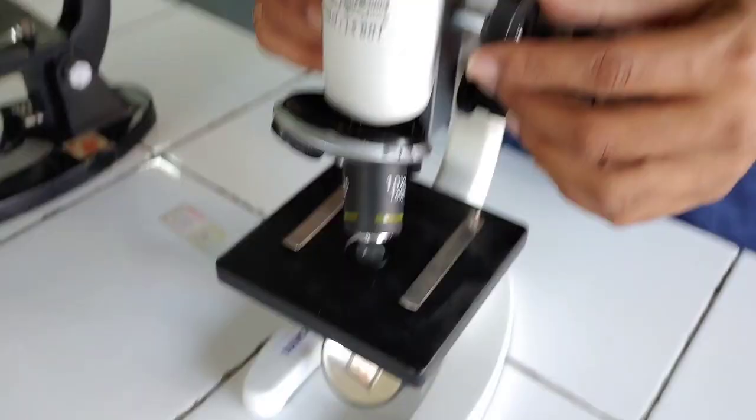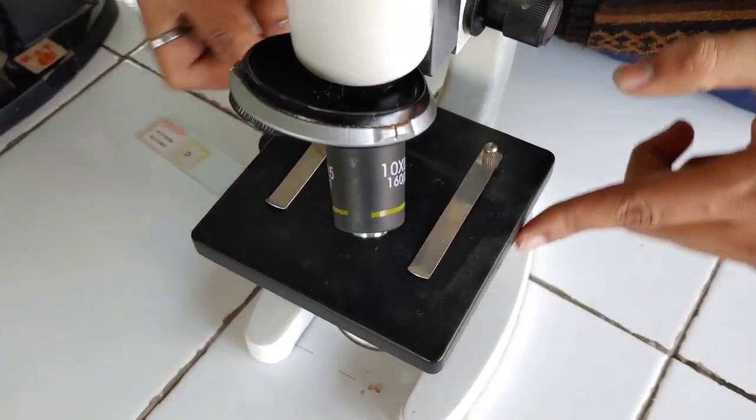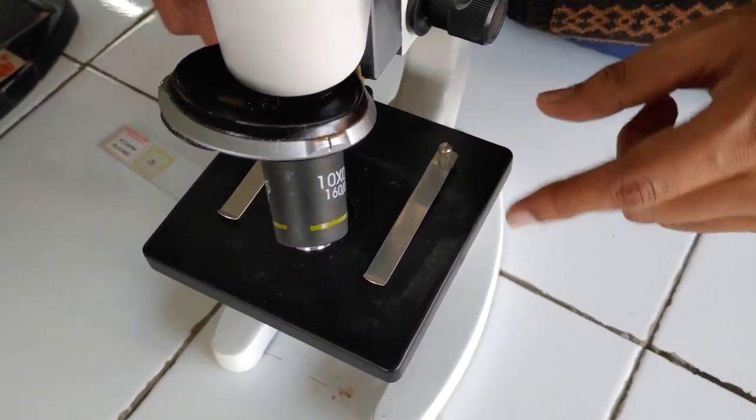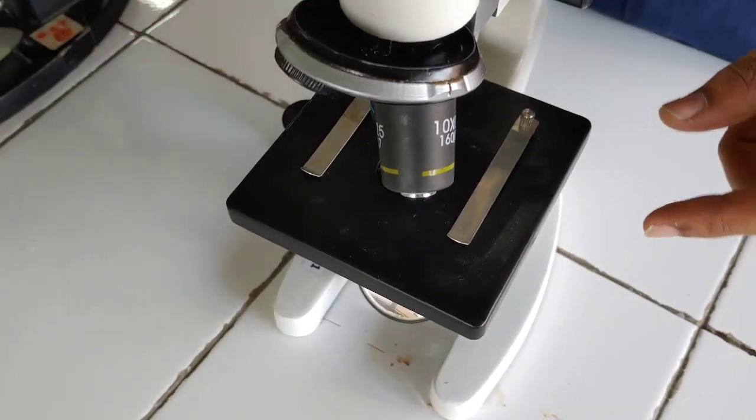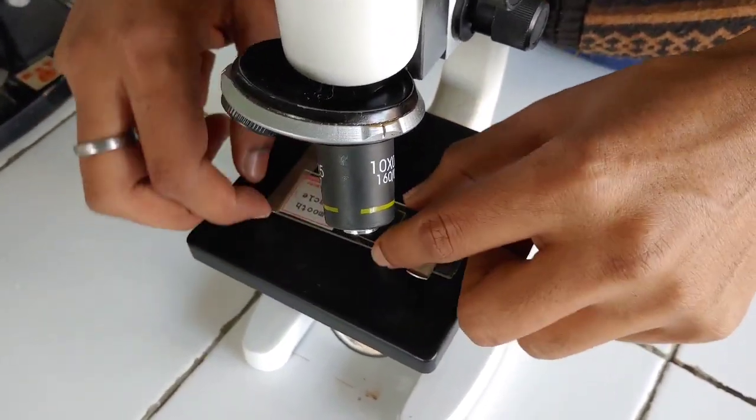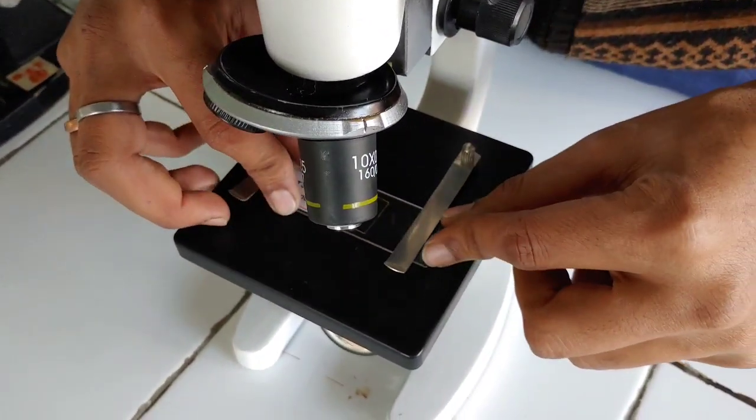And last is stage. Stage is the horizontal platform as is visible in the video, on which the specimen or some prepared slide you can keep on it, and you can view microscopically.